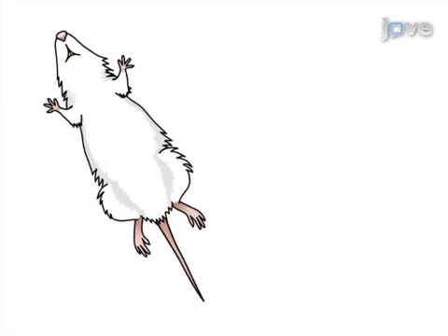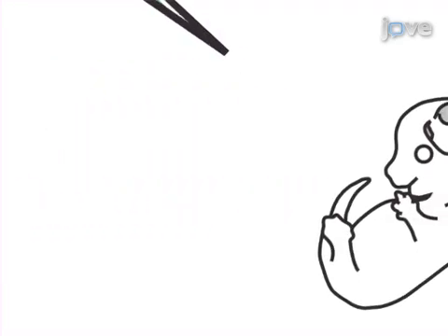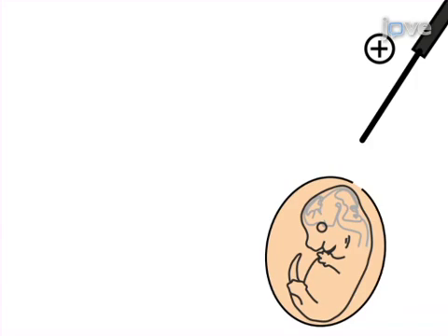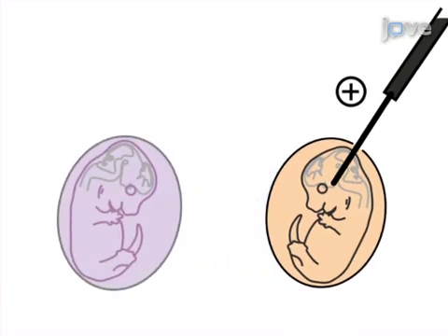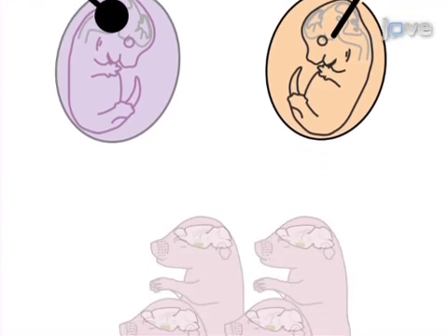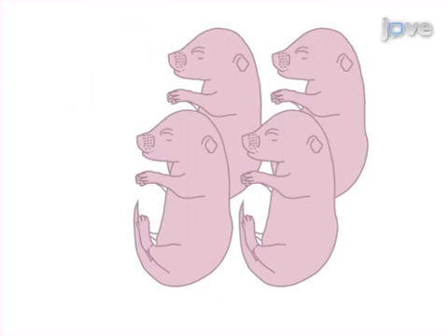This is accomplished by first anesthetizing the pregnant mouse and exposing the uterus through laparotomy. The second step is to inject the DNA solution into the third ventricle of the embryonic brain. Next, the positive electrode is positioned inside the uterus between the placenta and embryonic head, the negative electrode is placed on the outer uterine surface, and electric pulses are applied. The final step is to remove the transfected embryonic brains six days later.